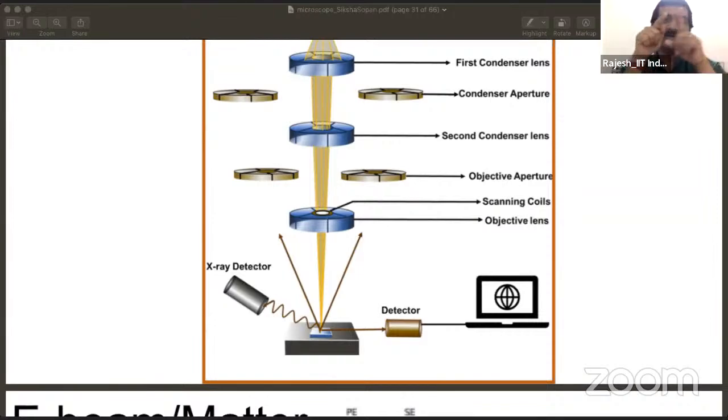The diameter of the tip, whether it is this sharp or even sharper, also decides the resolution of the AFM image, and that also restricts the image. As I was mentioning when I was talking about the scanning tunneling microscope versus atomic force microscope, that's where the scanning tunneling microscope has the advantage, because it doesn't take care of the force, rather it takes care of the current.